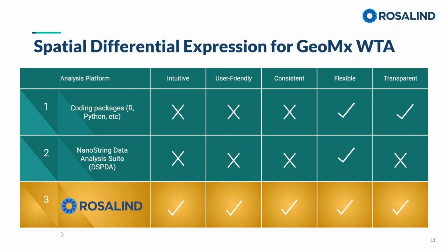You may have some experience with these items, but throughout all of these different steps that we've talked about through this masterclass, and even here with spatial differential expression and the methods you might choose, choosing a differential expression method and model is often not very intuitive, and it requires you to have a lot of statistical and spatial knowledge.